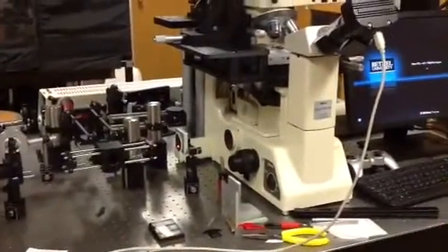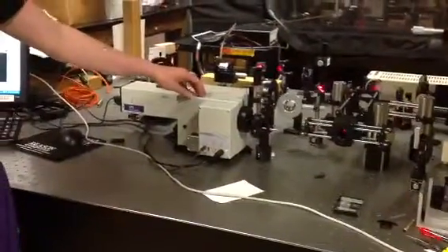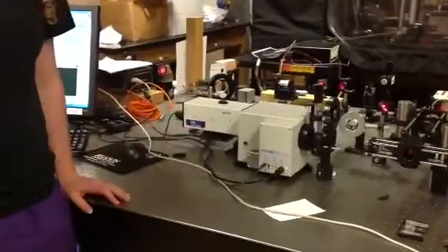Right now we actually have it blocked off, but this is where we put the sample for the Raman spectroscopy. The laser comes then back into our spectrometer right here, and then here we have our camera. So I'm going to ask Dan to come in here to work with the VI.